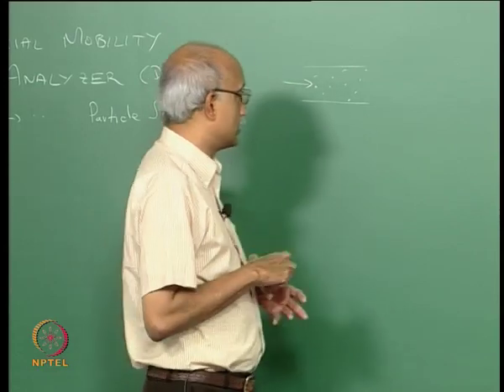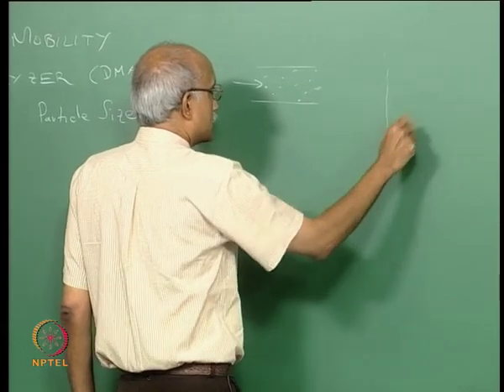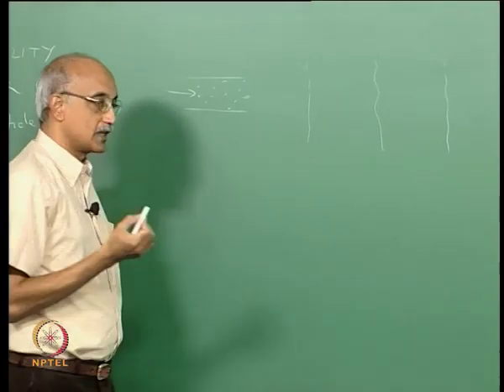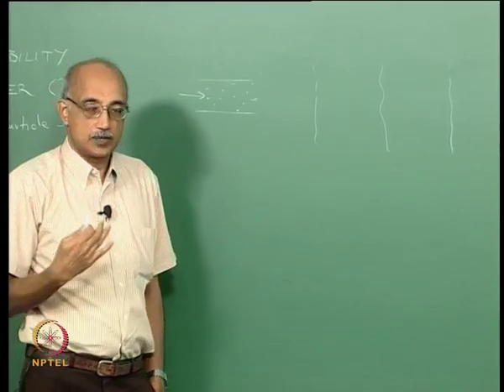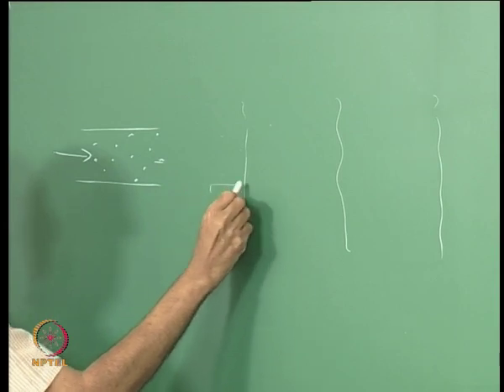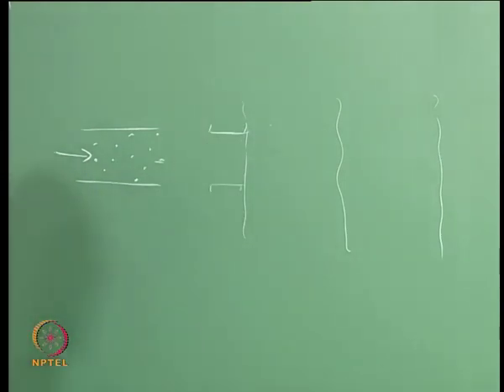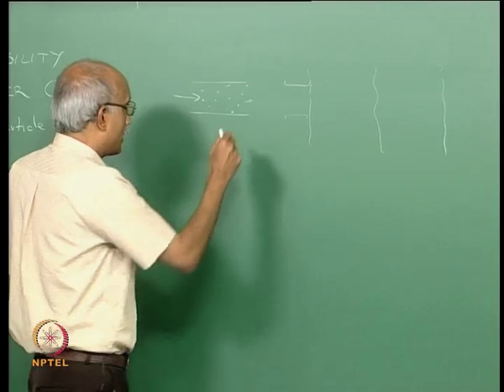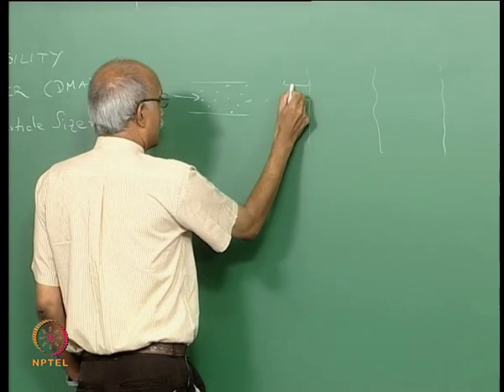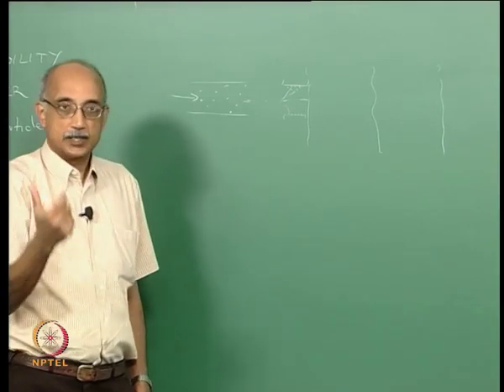And the reason for that is as the particles are flowing in this direction, you have various cells that are set up like this, and the capture screens are offset from the flow direction, and they are located in such a fashion that in order for the particles to get captured, they must actually diffuse to the screen. And so as the particles are flowing through, the finest particles, because they have the largest diffusion velocities, will deviate first from the flow path and get captured on these screens.